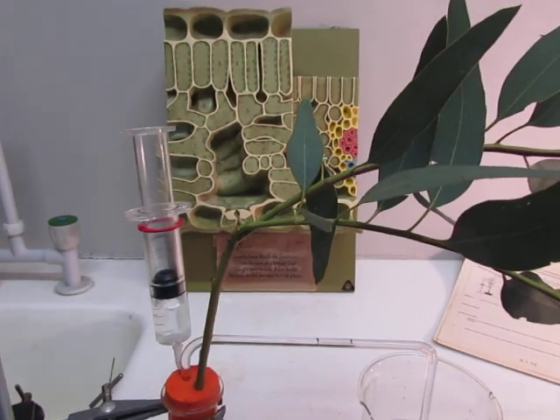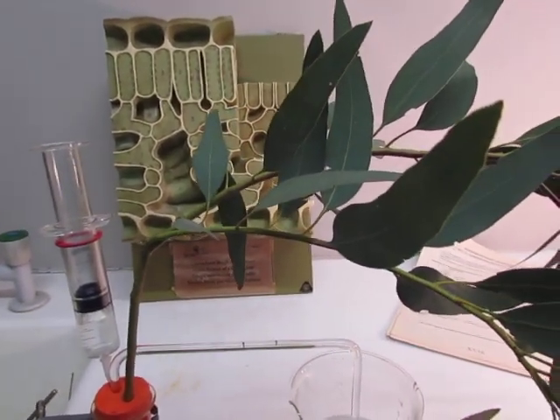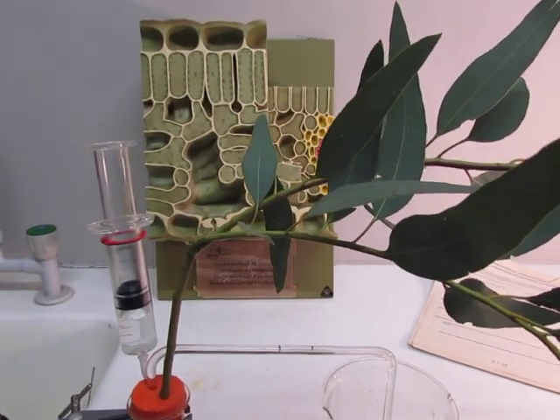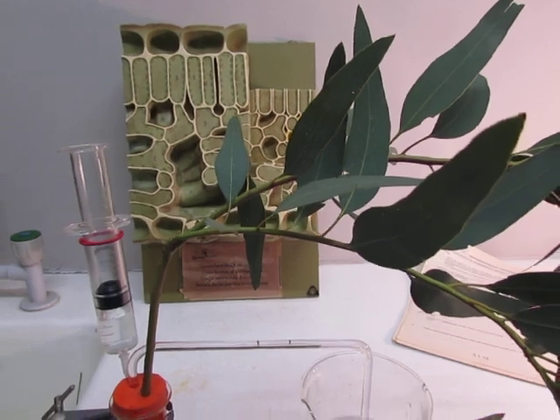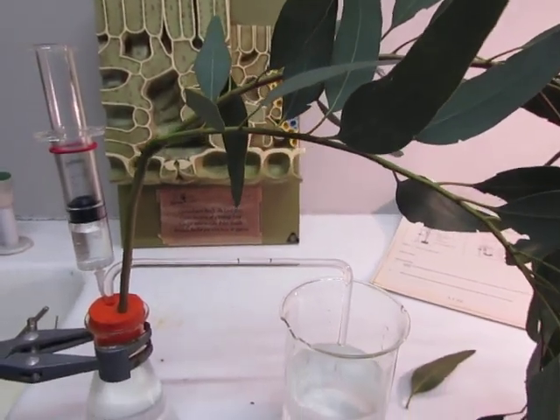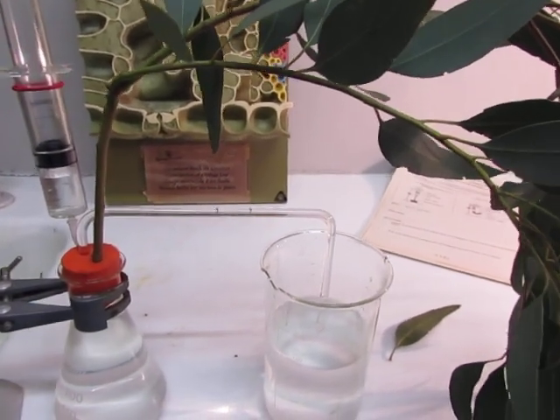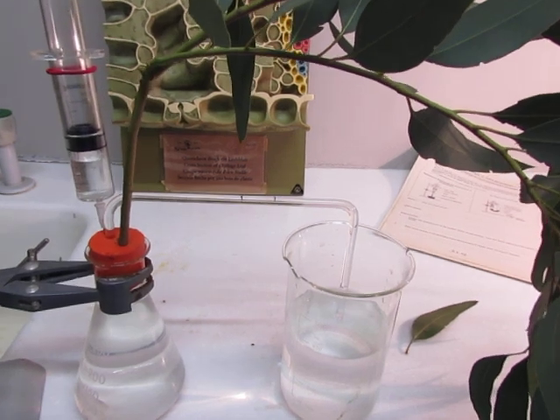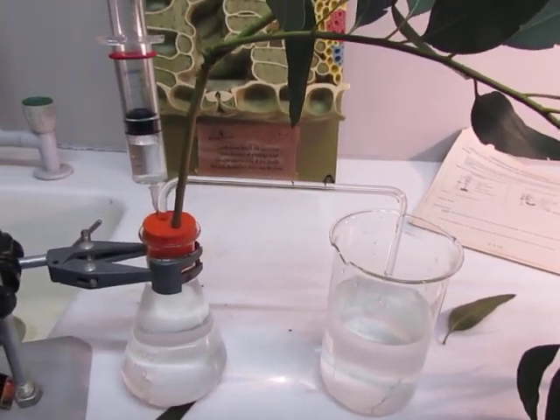Or I might also formulate an operational question, and the question might be something like, what would the effect of different abiotic or environmental factors be on the rate of transpiration? So you see, if you set it up airtight, there my bubble is still moving, and it's really hugely exciting to see the movement of the bubble and to take actual scientific measurements.